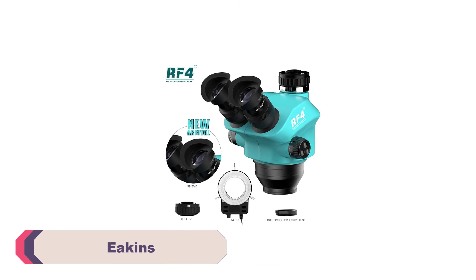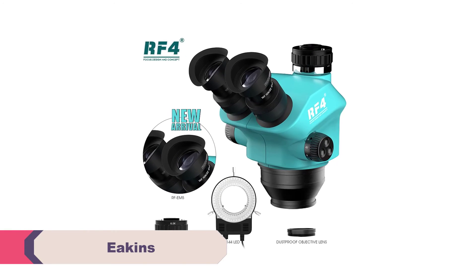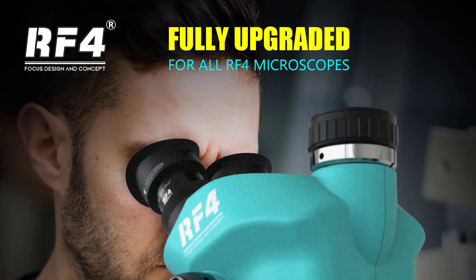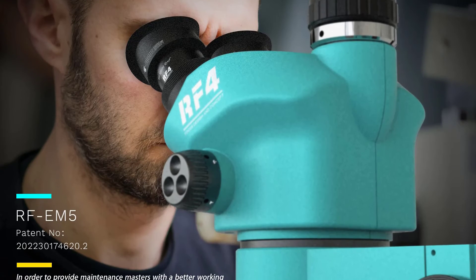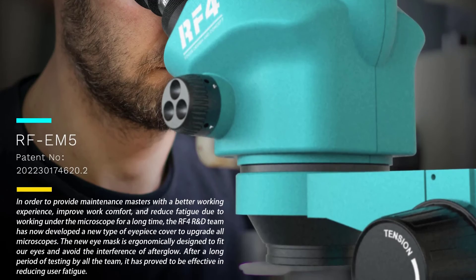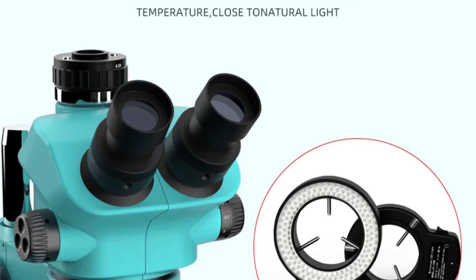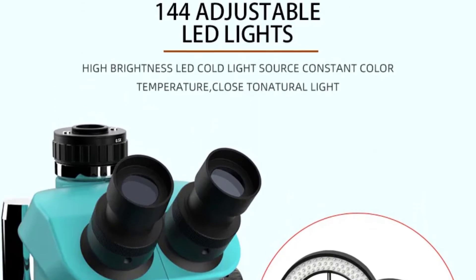Number 2: Eken's Trinocular Stereo Microscope. The Eken's Trinocular Stereo Microscope boasts a 48MP to 55MP Lab Simul Focal Video Microscope Camera, providing unparalleled clarity and detail in the images it captures. The high-definition imagery is perfect for analyzing intricate specimens, making it ideal for various scientific and research applications. The trinocular drawtube design is a game-changer — it allows viewing specimens through both eyepieces while simultaneously capturing images or videos with the camera, greatly improving efficiency by enabling easy switching between visual observation and documentation without additional equipment.